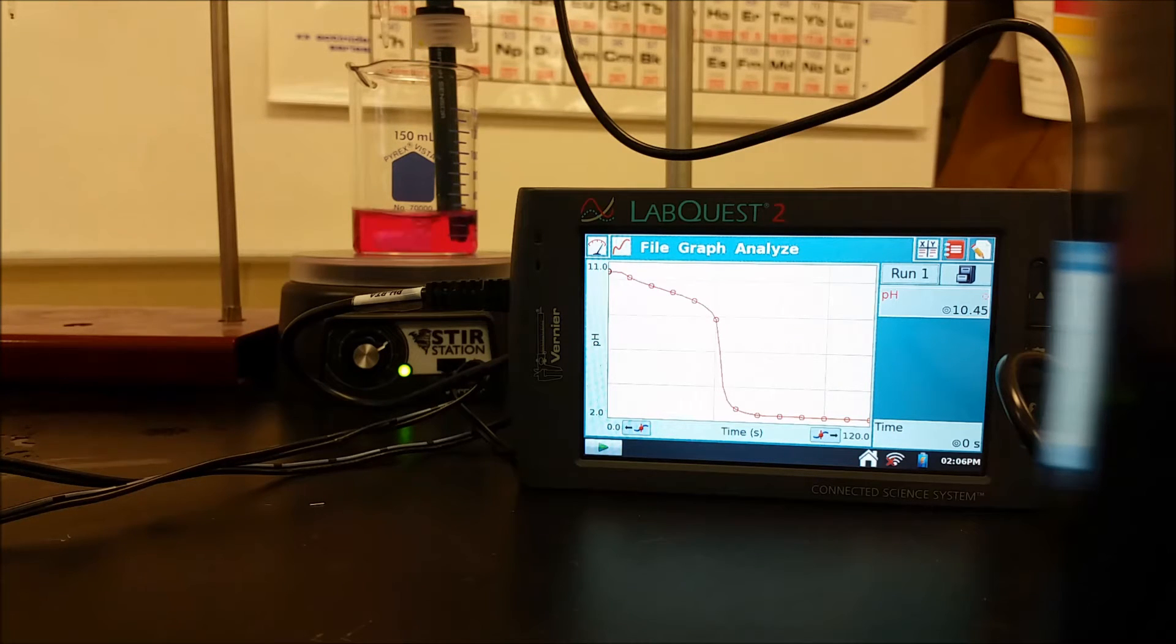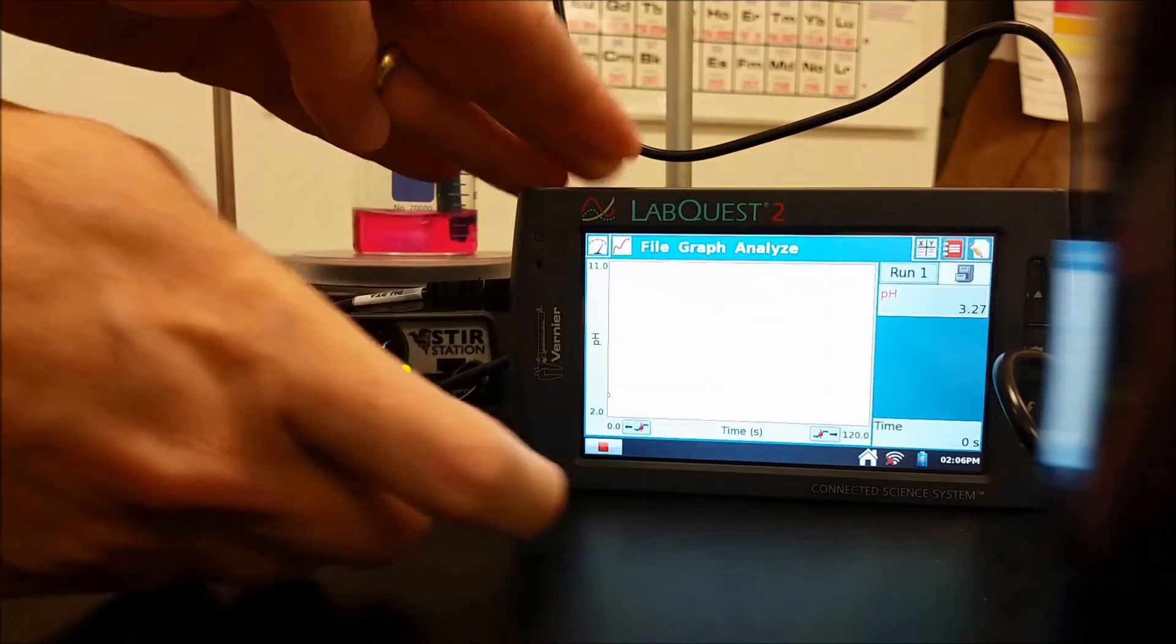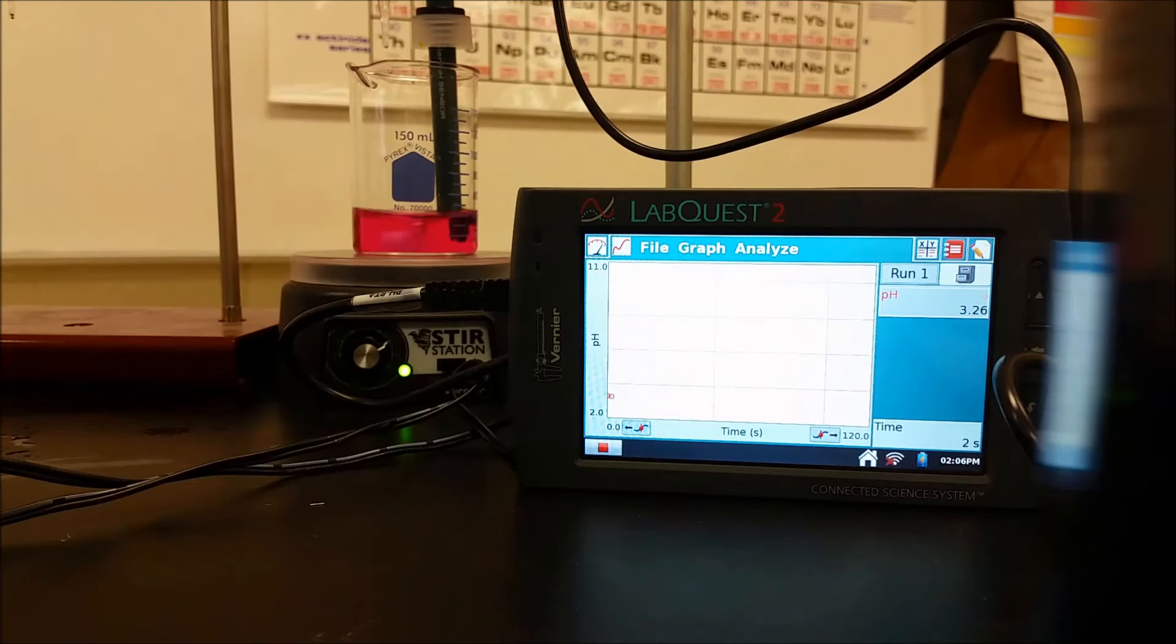I'm going to start adding sodium hydroxide in a minute, which is in a burette above the setup here. Before that, right here, I'm setting up our lab quest so that it will track the pH.